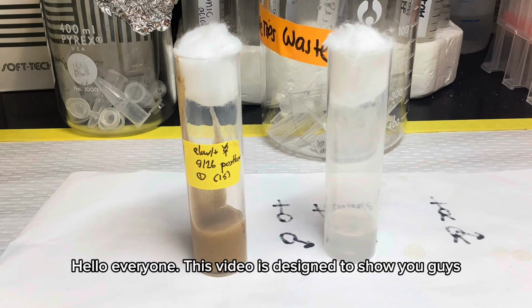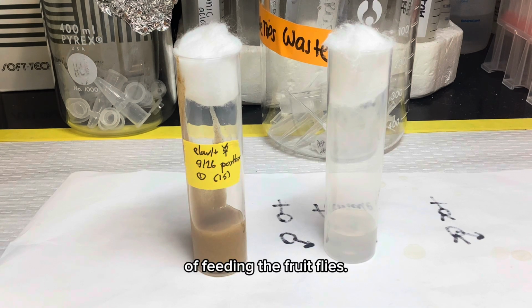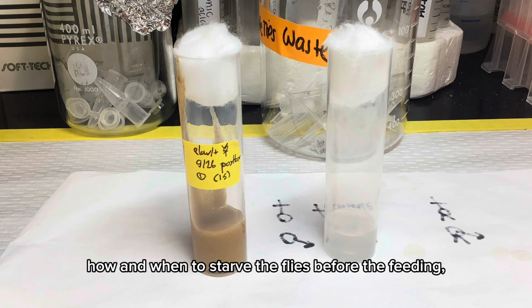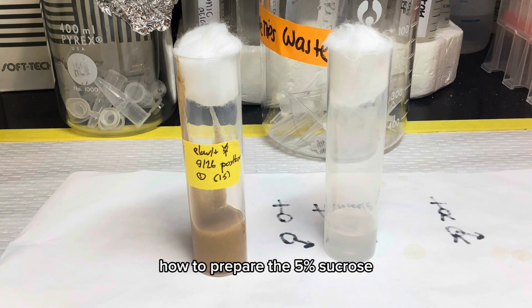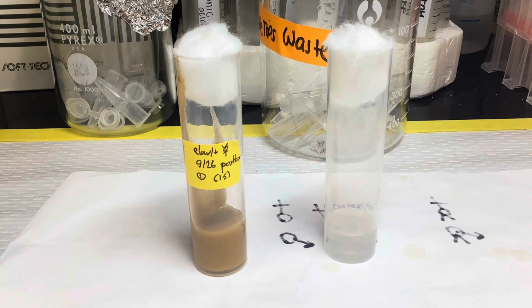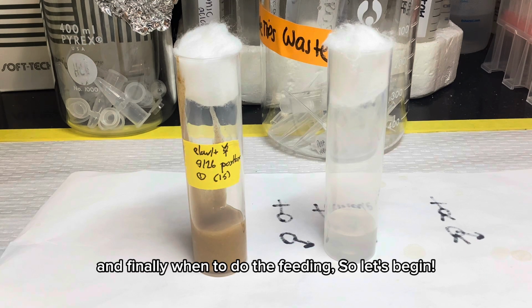Hello everyone, this video is designed to show you guys how to properly conduct the protocol of feeding the fruit flies. I'll be going over why these flies are getting fed, how and when to starve the flies before the feeding, how to prepare the 5% sucrose and the various probiotic and postbiotic interventions, how to properly feed the flies through the capillaries, and finally when to do the feeding.